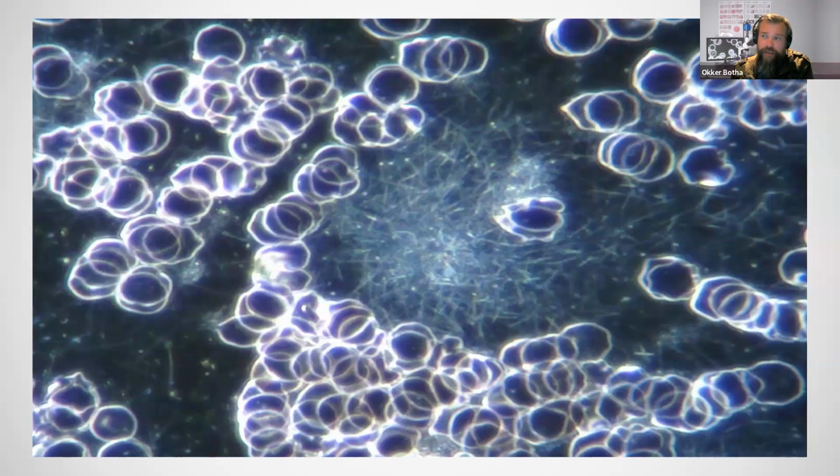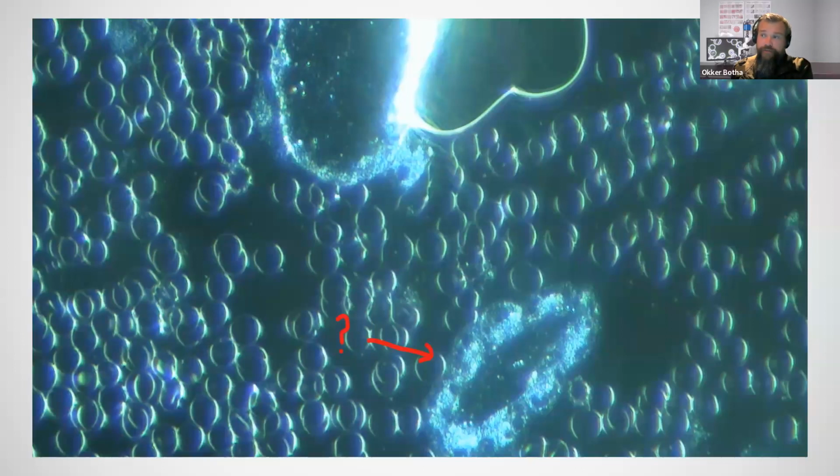Now, normal microscopes don't have that feature. So to achieve a high level of magnification, you need to use the 100 times objective. That also has its own set of challenges, because it's quite difficult working with that objective. And if it's not a very high end objective, it also allows through too much light, and it becomes quite difficult to see.